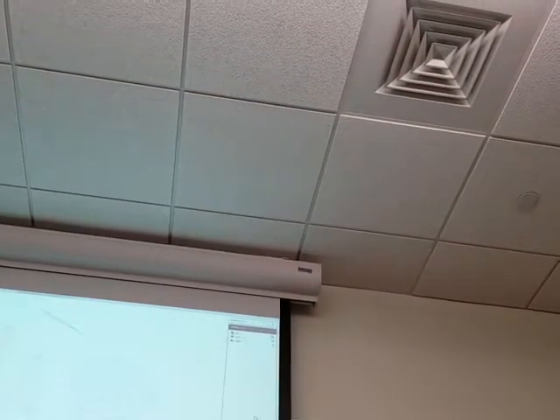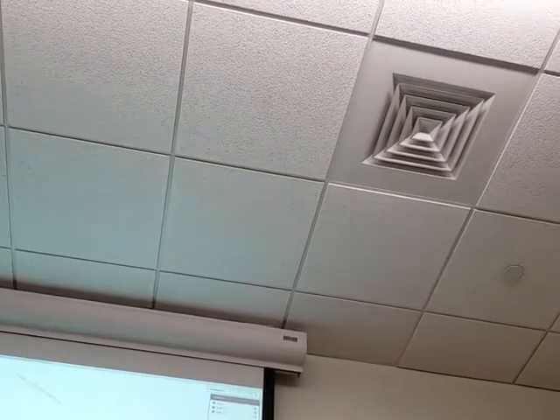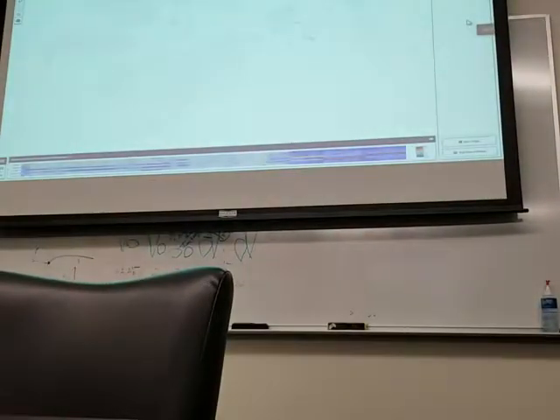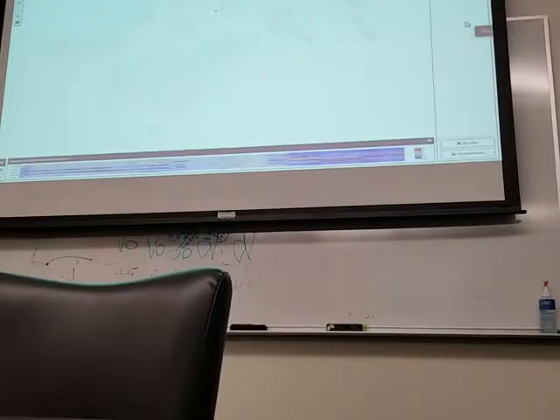So there is a bit more overlap between 128 and 132, but you still see a little bit of separation here. And then we can look at the 5' one as well. This is the separation for the 5' chemistry, with this blue one being the healthy control, and these orange and green ones being the SLE ones.